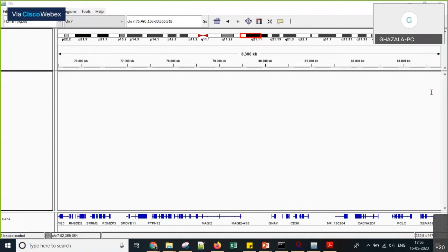The reference genome actually comes from the 1000 Genomes Project, which you can also read about, where 1000 people were selected, all healthy people, and their whole genomes were extracted and standardized based on that, to make sure all the samples are from healthy samples. And it is better to choose the latest version, for example if you are starting your study right now or after this.